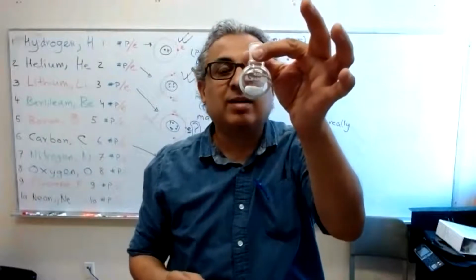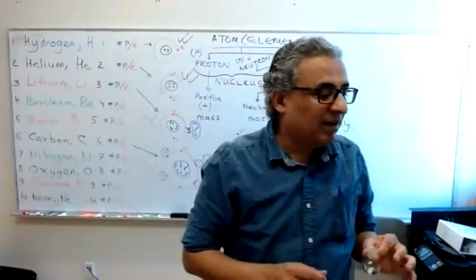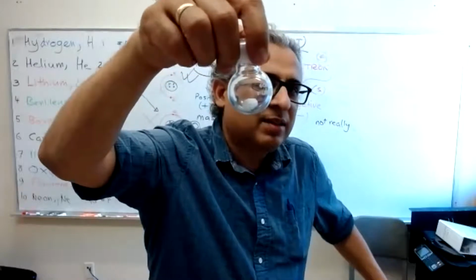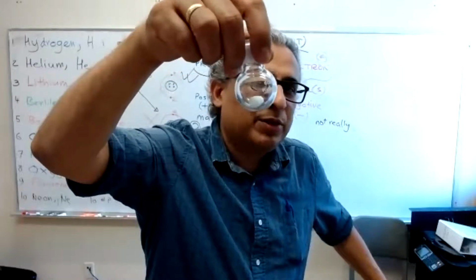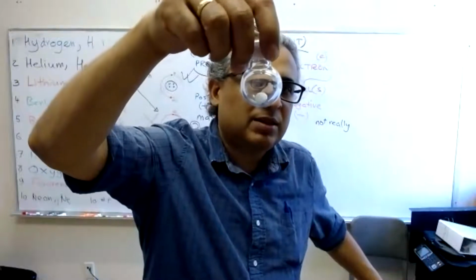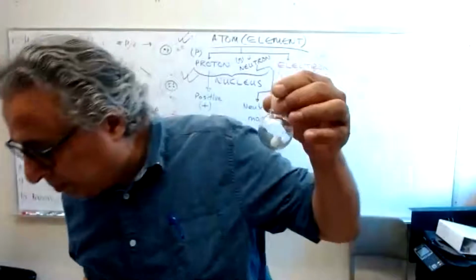Say that again, Sandra. So it can mix. Mix. It can mix. It's an incomplete answer. What can mix? The stir bar can mix, if there is liquid.